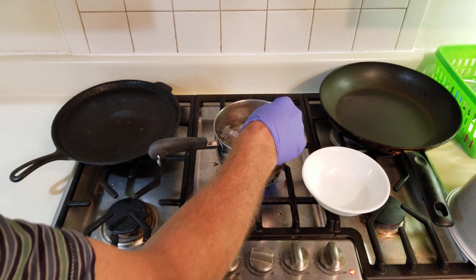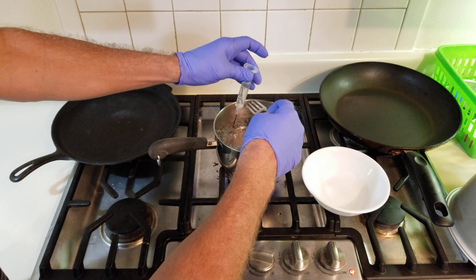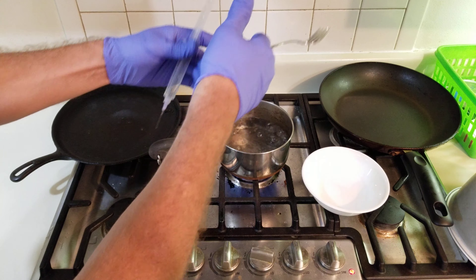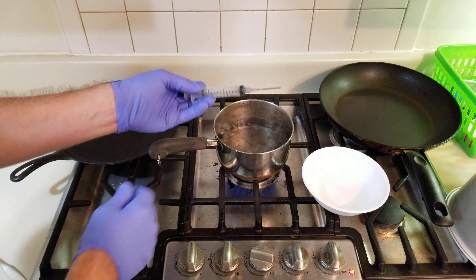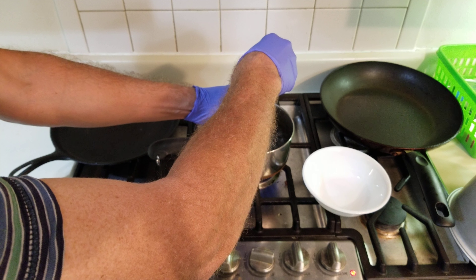After boiling for approximately five minutes, you want to carefully grab this container — it's a little hot, but you can hold it. Place this in, the plunger in, push it all the way in, and withdraw water from the boiling water.